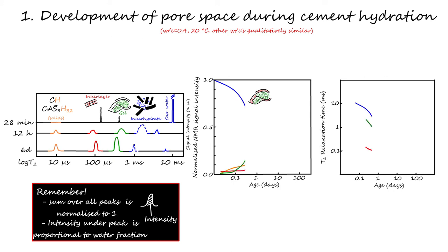The trends regarding the capillary water and solids continue, but now the interlayer water population increases slightly. The gel pore population increases strongly. Note that the capillary pore size decreases rapidly. Now, after about 2 days, the pores confining all 3 water populations have reached an almost constant size. The gel pore formation continues to be rapid, but now the interlayer formation is almost as fast.